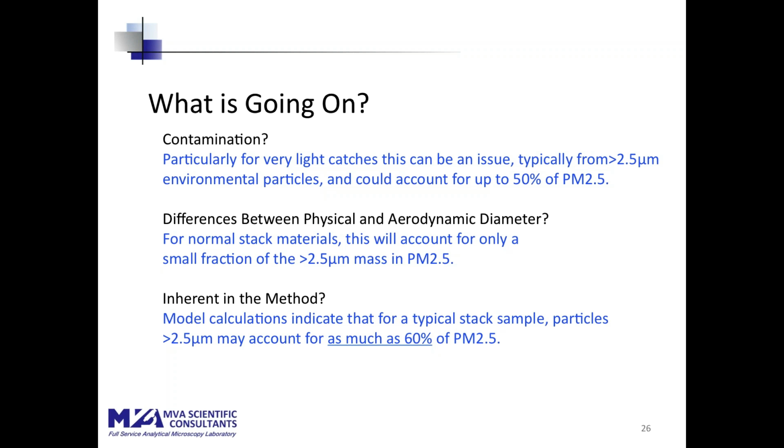For human health, the insult to the lung is actually not the mass of particulate, it is the surface area of the particulate. And the surface area of a particulate sample that is composed of 0.2 micron particles is 10 times the surface area of the same weight of particulate composed of 2 micron particles. So this is a factor of 10 difference in impact on human health that is not addressed by the method.